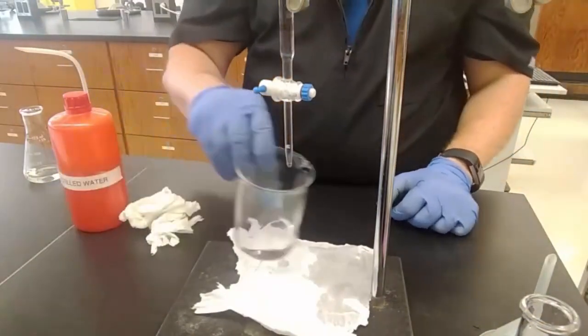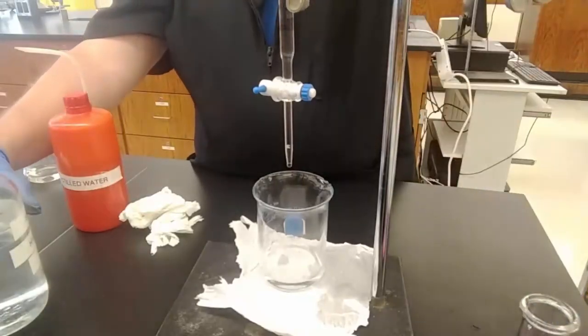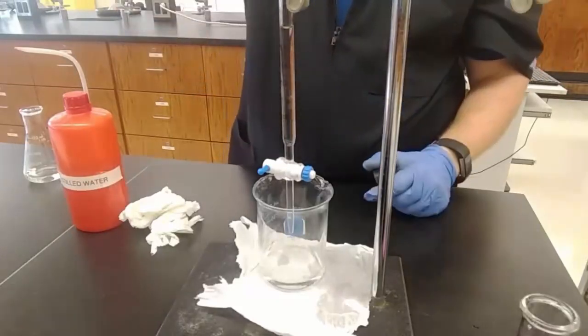All right. So that's 2 of 3. So we went from whatever the value was I said before to 19.89. As expected, it took about 17 milliliters. Again, I need to refill, so I'll put my waste bottle underneath. I'll put my funnel back in. I'm going to lower it down so that it's as close to not pouring over my head as possible.